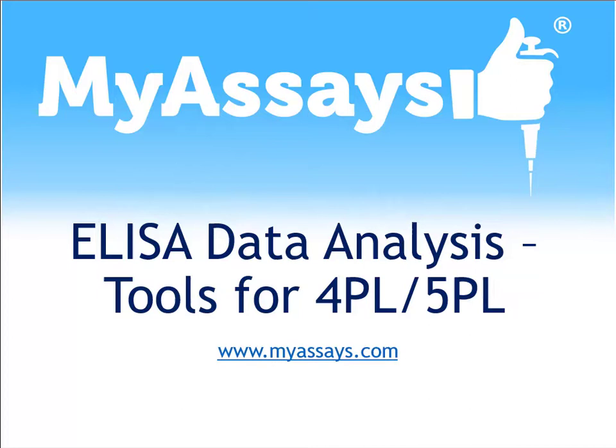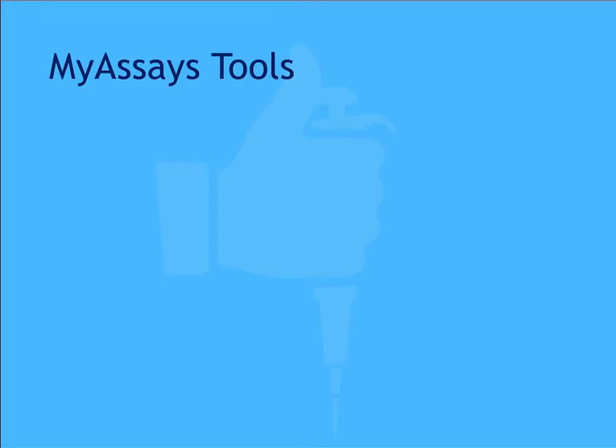In this video, I'll go over MyAssays tools for performing 4PL and 5PL curve fits for ELISAs. MyAssays offers several different tools for performing complex curve fit methods perfect for ELISA data analysis.